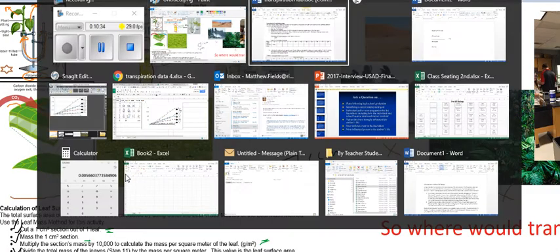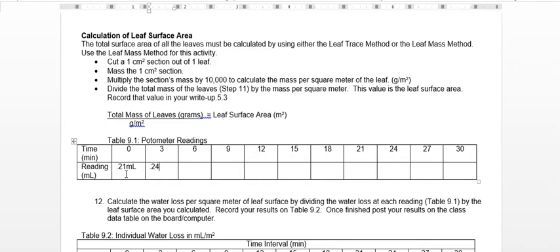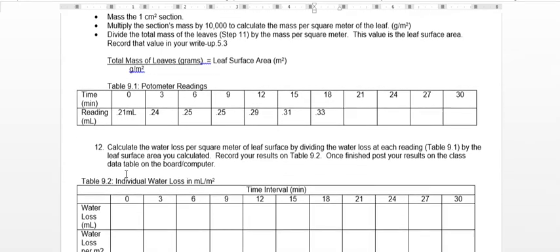And maybe at the 6-minute mark, it was like 0.25. Didn't change that much at all. Maybe it's 0.25 there, 0.29, 0.31, 0.33. And I'm going to stop there because you get the idea of what's going on. So the water level didn't change that much over the course of the 18 minutes.